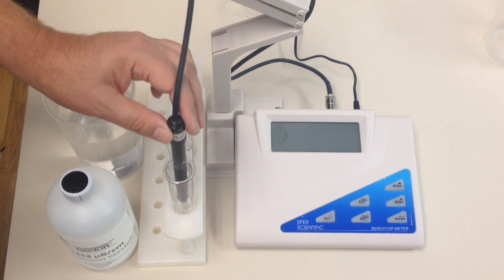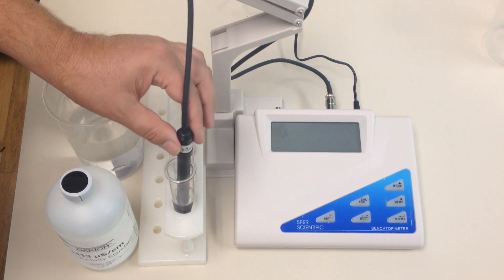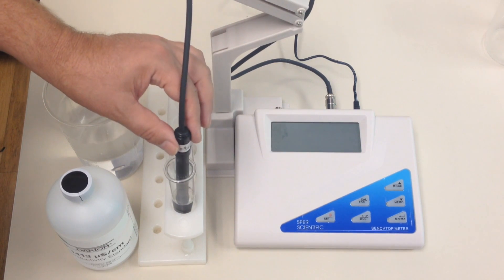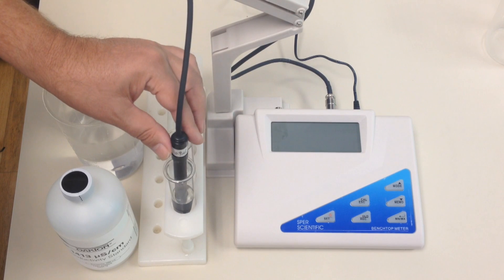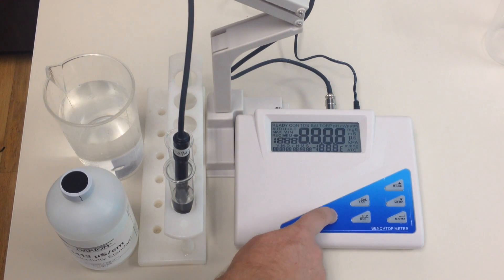Put it into the second beaker. This is the one you're actually going to be calibrating from, and here you have to make sure you get all the air bubbles out of the probe. Let the probe stabilize for a little bit, and at this time, and only at this time, do you actually turn on the meter. So now I'm going to go ahead and turn on the meter.